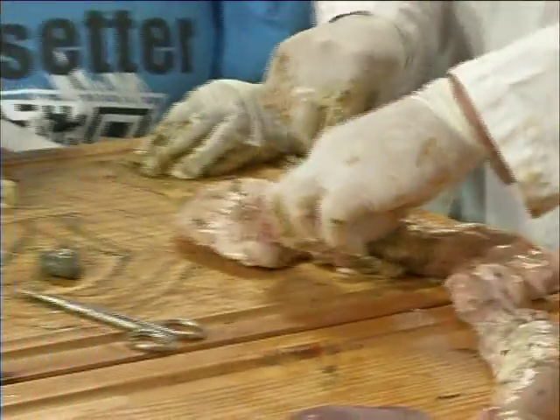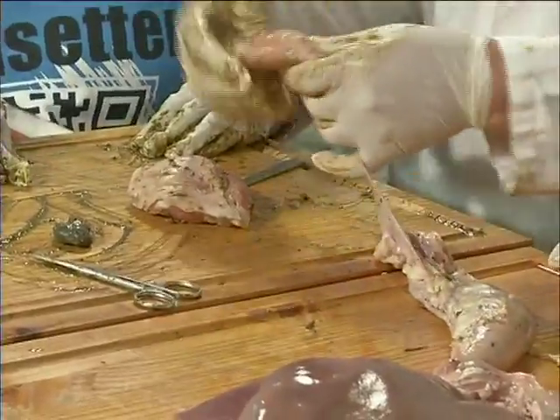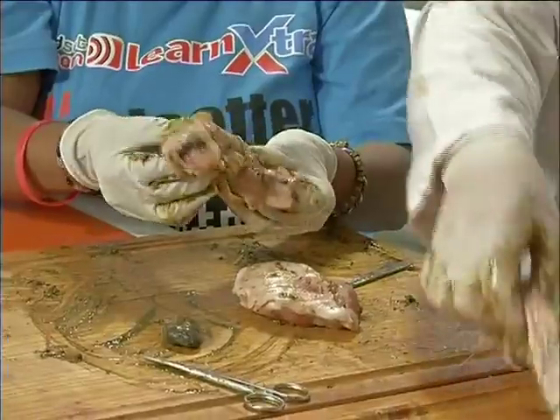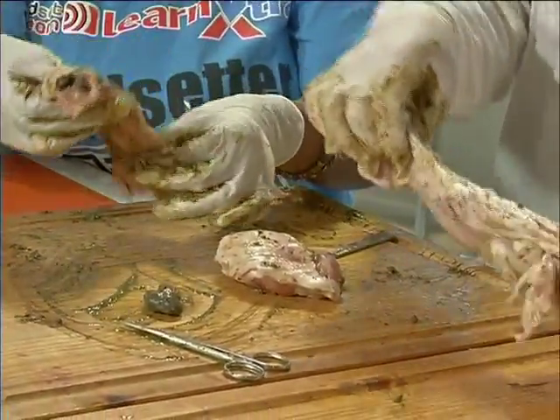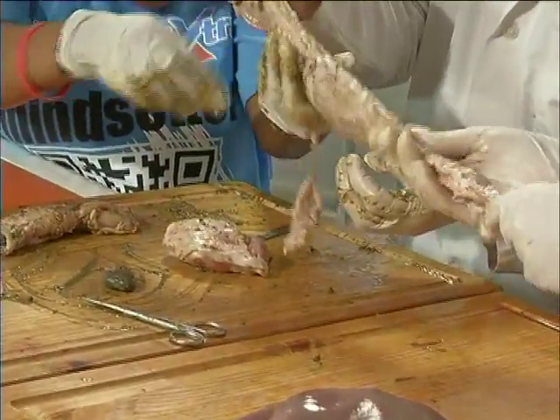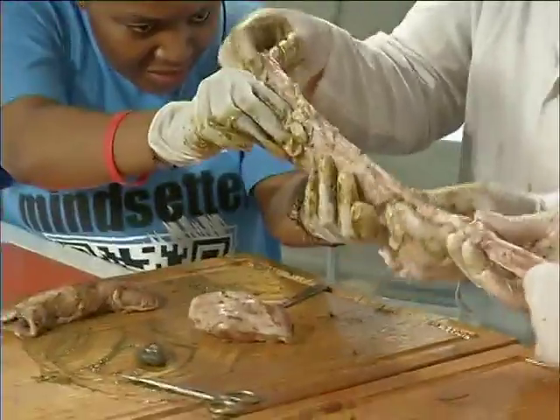Now this is where this whole piece is nice and thick. Feel those muscles in there, right? It's a very important thing. You'll notice that this is not quite as muscular as that end bit. Feel how soft this is. And this one is quite muscular, that tough. That's very tight. What's this? Oh, that's the feces.